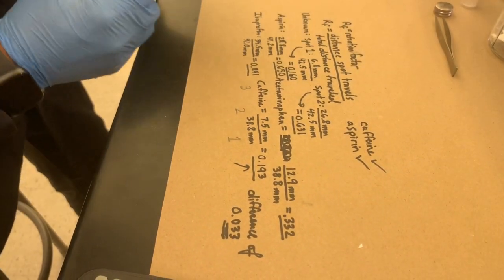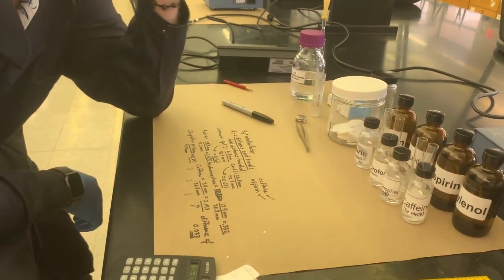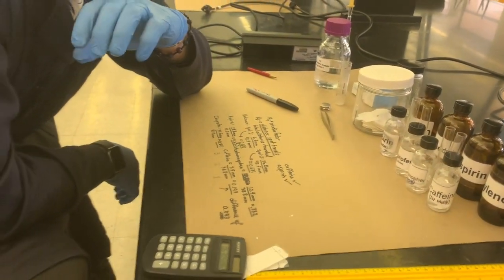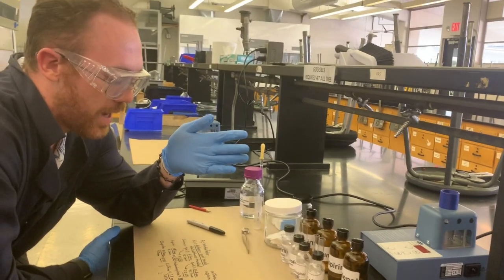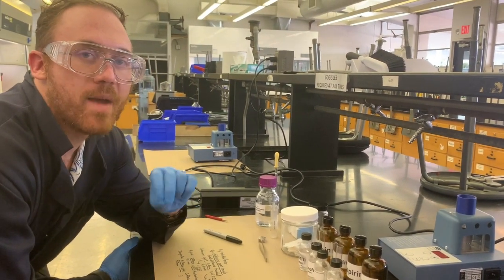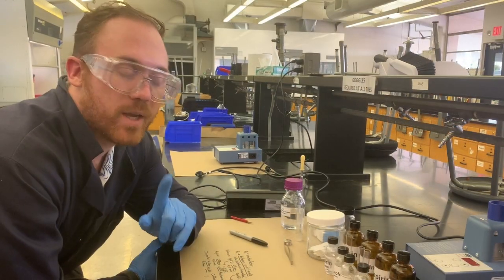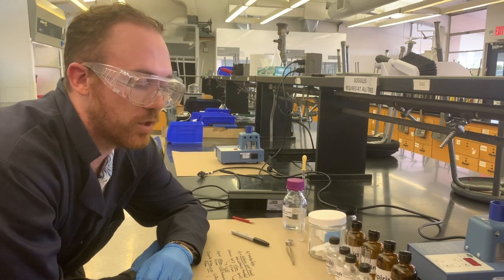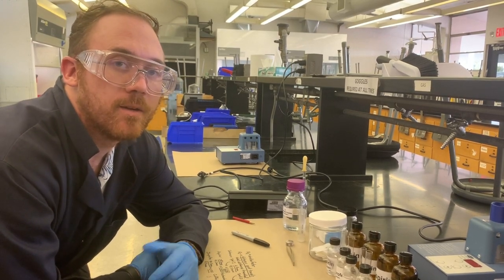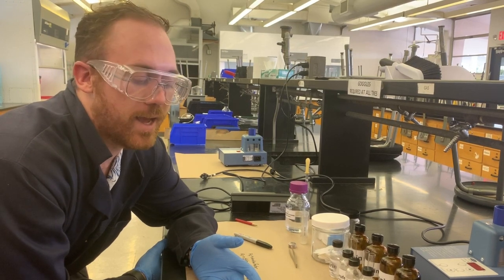One thing that's worth remembering is that the further the distance you get in any of these different kinds of trials and different kinds of TLC methods, the more you want to get maximum separation between the samples. Another important thing, as you noticed when we looked at the TLC plates themselves, is there were some pretty big blobs still sitting on the TLC plate.